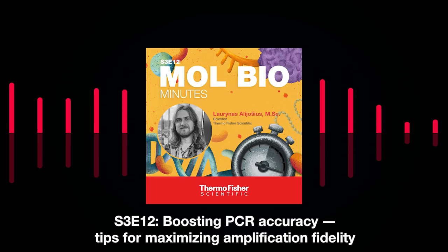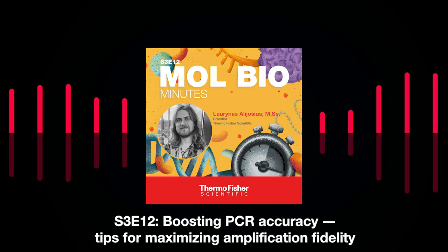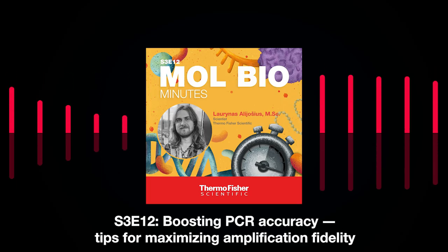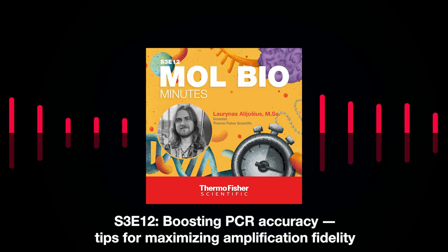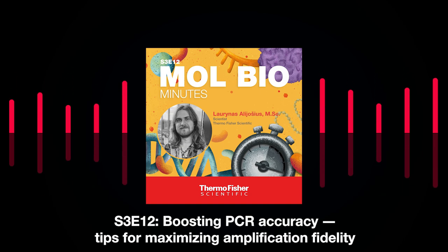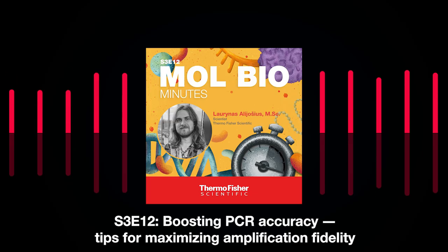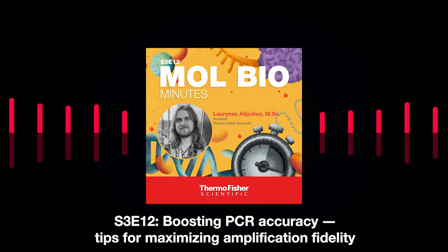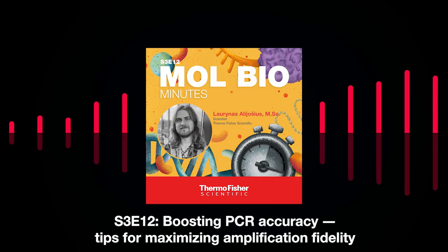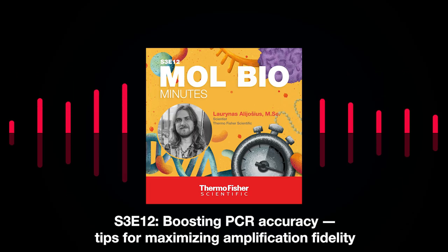Having low numbers of errors is important for some methods. Let's take, for example, sequencing. It's very important to have the correct amplified sequence for sequencing experiments such as de novo sequencing, or if you're sequencing your samples after you perform mutagenesis experiments.